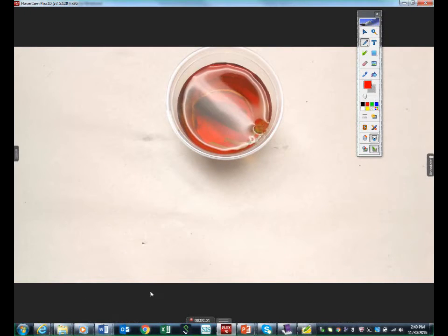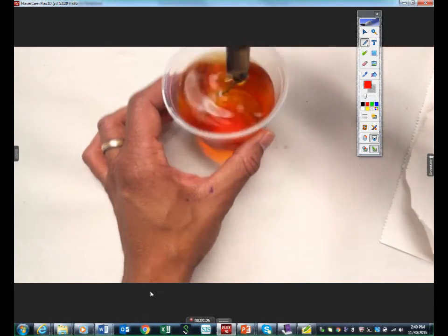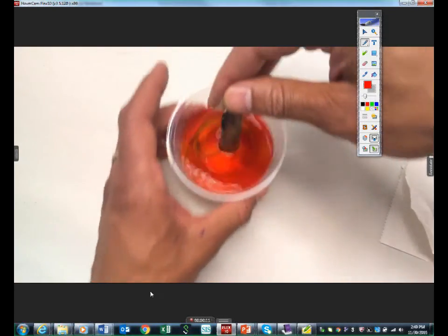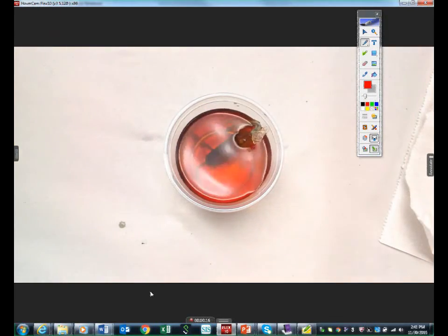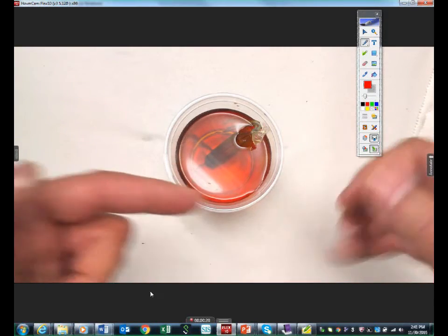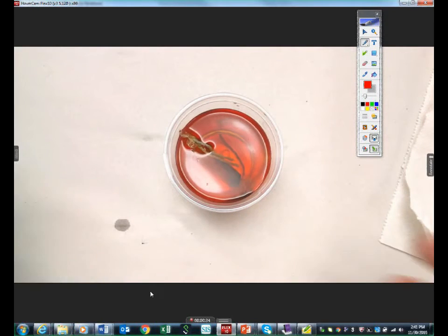Let's talk about our results. At this point, iodine is in the water but it's also in the bag. Starch has not left the bag. Water has gone in through osmosis. Iodine goes in through diffusion — not osmosis, but diffusion. So water went in through osmosis, iodine through diffusion. Starch is impermeable. Water and iodine are permeable.